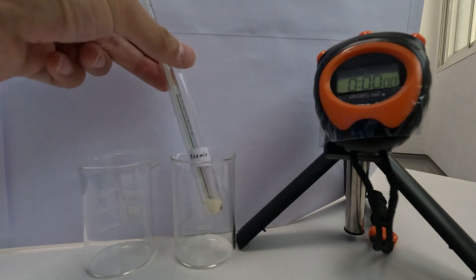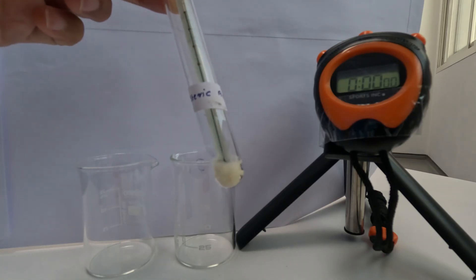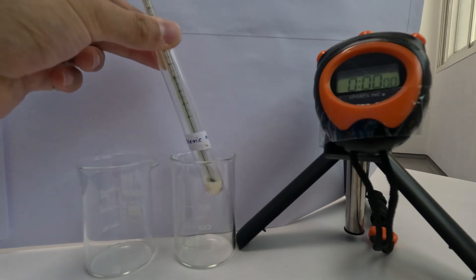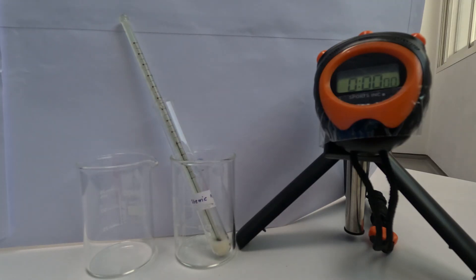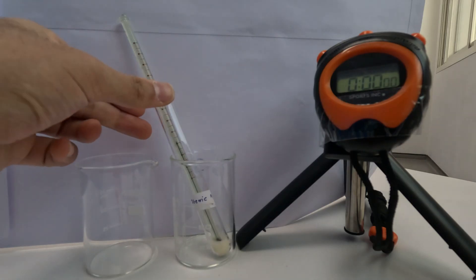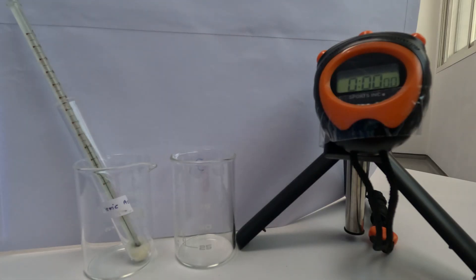I have here some stearic acid and as you can see it's in the bottom of the test tube — it's a solid at room temperature. What we're going to do is add some hot water to this beaker and wait until all the solid stearic acid has turned into a liquid. Once it's all turned into a liquid, we're going to transfer it to this beaker, start the stopwatch, and every minute record the temperature of the stearic acid to plot the cooling curve.